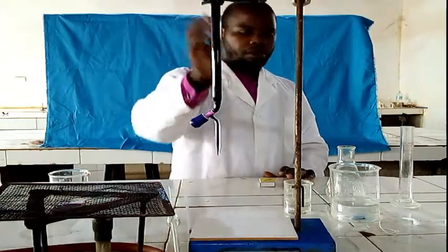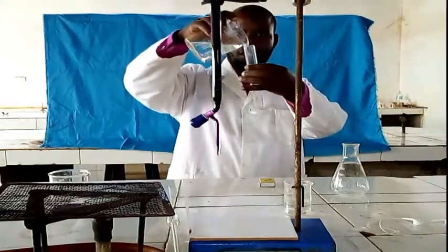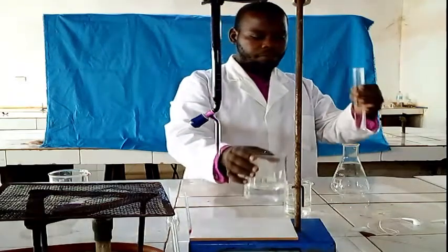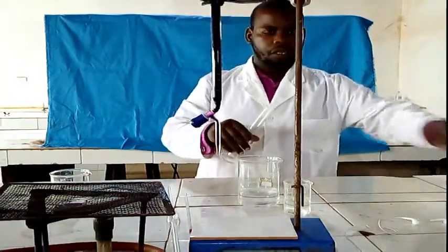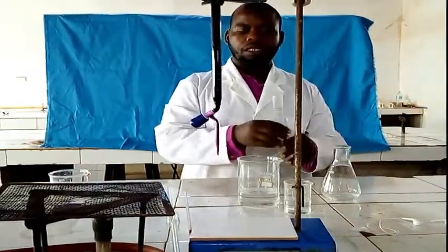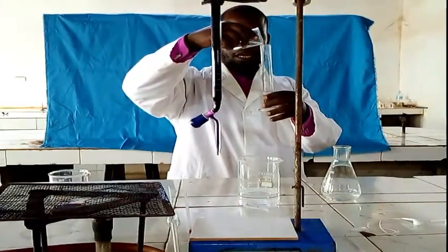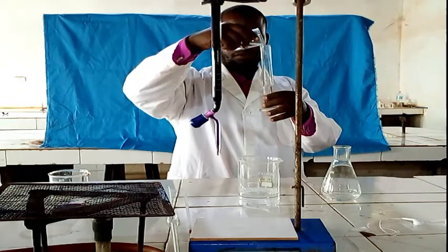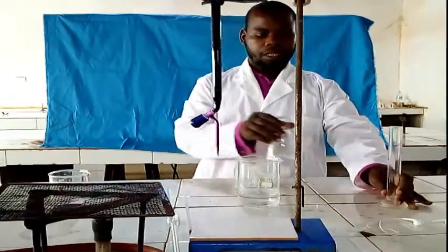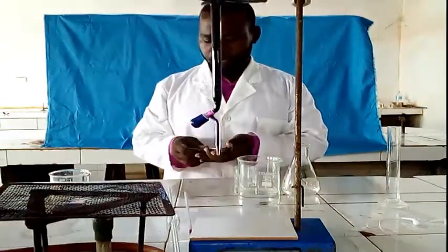First we measure 25 of oxalic acid, then we pour it into a conical flask. Then we add 25 of sulfuric acid, the same measurement. Then after mixing, remember we are going to heat. We have to switch on the source of heat.